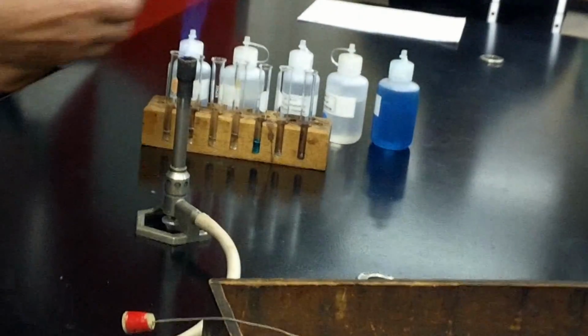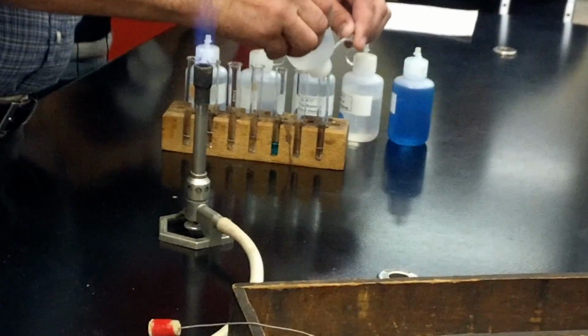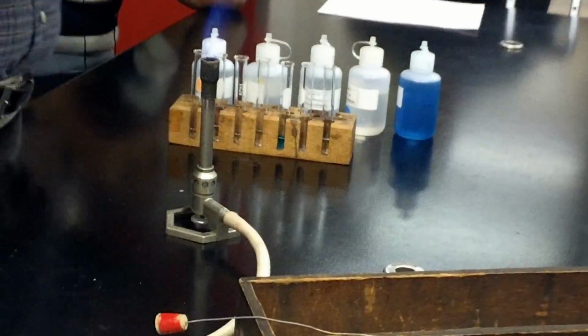All right. So when you're working with this, cleanliness is very important. So we'll take a cleaning solution, which is hydrochloric acid, and I'll put that in the end here. So the hydrochloric acid just serves the purpose of cleaning off my little metal wire, because I'm going to get contamination between the colors, and I don't want that to happen.